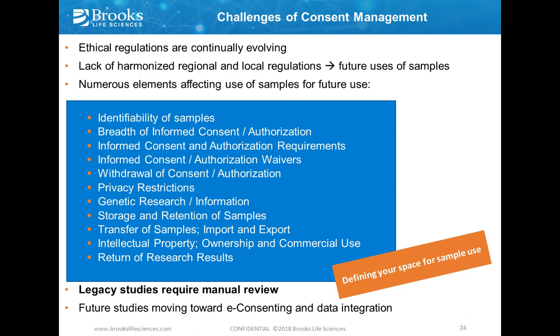So, what are the challenges of consent management? Of course, if you go for a global trial or study, we have a diverse ethical environment where regulations are continually evolving, new ones are emerging, there is anticipation of regulation change, and they may differ from country to country because of cultural heredity. That makes it pretty difficult to work on a global basis with one ICF and to fulfill all the requirements from the ethical perspective.